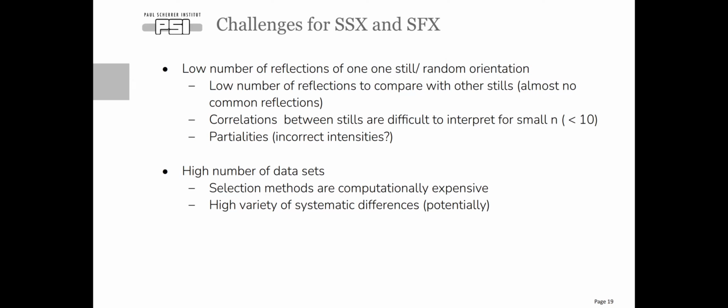Last point, again, is that we have so many crystals, so we can also have many different systematic differences in there. So it gets hard to find out what's useful to merge.